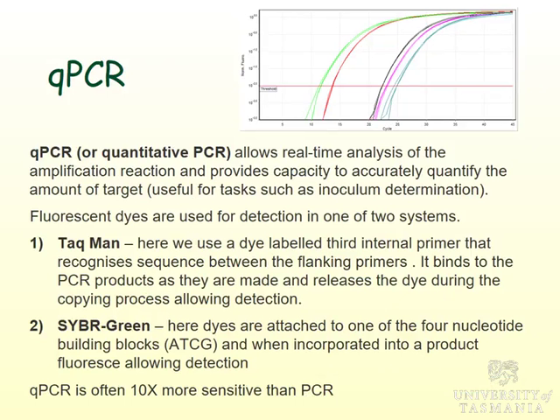And there's more variants, and this is becoming more important these days in diagnosis. There is something called quantitative PCR, or qPCR, sometimes called real-time PCR. So it's exactly the same process of heating up, cooling down, heating up, cooling down, breaking apart, annealing, extension.